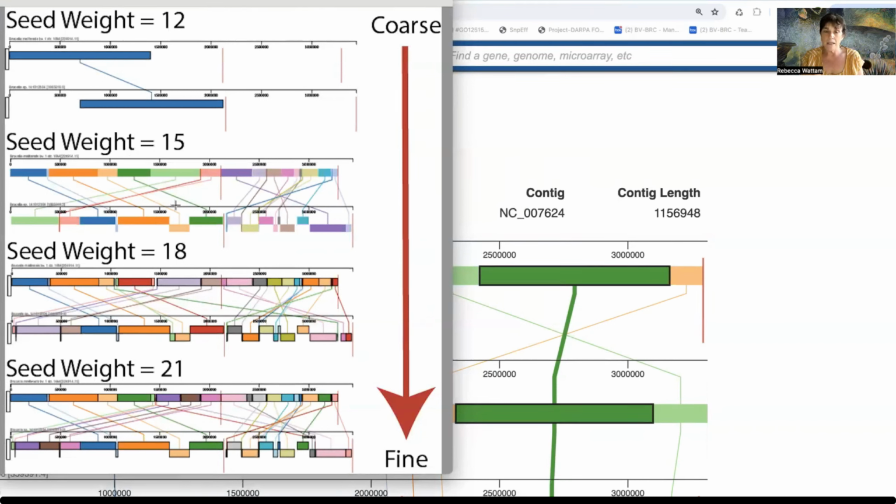This genome is in a number of contigs, and there's been a lot of rearrangement. Does that mean that the genome is actually rearranged, or is it just the assembly because of how deep it could get? This wasn't assembled with PacBio, or it's not a hybrid assembly, so we're not sure of the order of these contigs, but there are a lot more blocks. And you see it's breaking up that Brucella too, the melitensis one, the reference genome, as it tries to adjust to that. If you go up to 18, even more. And as you go up to 21, even more.